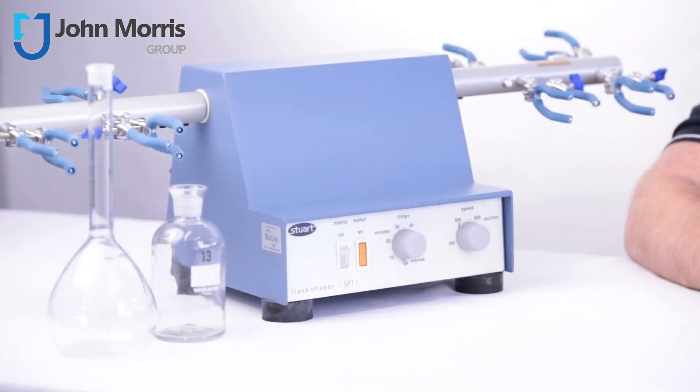In this video, we'll be exploring the Stewart flask shaker, model SF1. The SF1 has two arms and each of those takes up to four clamps, allowing up to eight bottles or flasks, up to a total load of three kilograms.